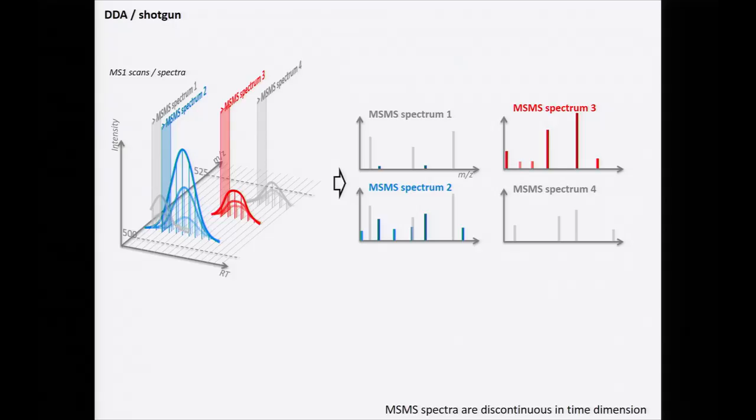You see here this blue spectra, which is actually coming from the highest intensity peptide in my picture. It's actually one of the most contaminated spectra. And the reason for that is that, by chance, it's actually co-eluting within one Dalton with the gray peptide here. And as you can see here, all the gray fragments, you're lucky I colored them in gray, but the mass spec is agnostic again, what is gray, what is blue.